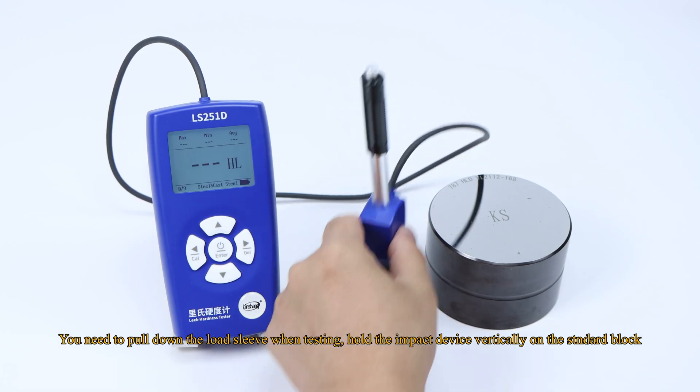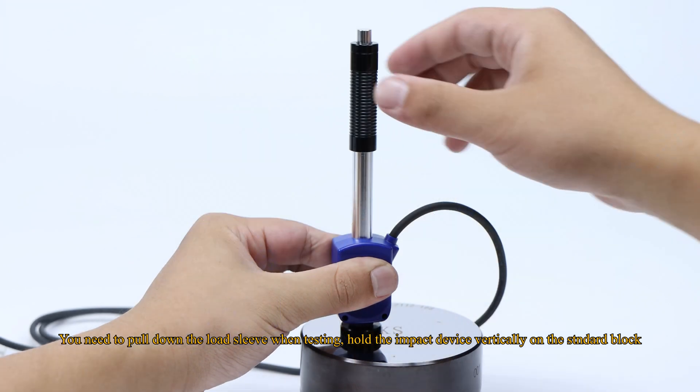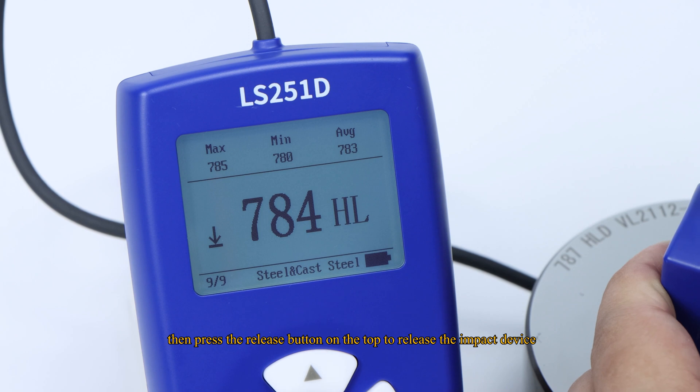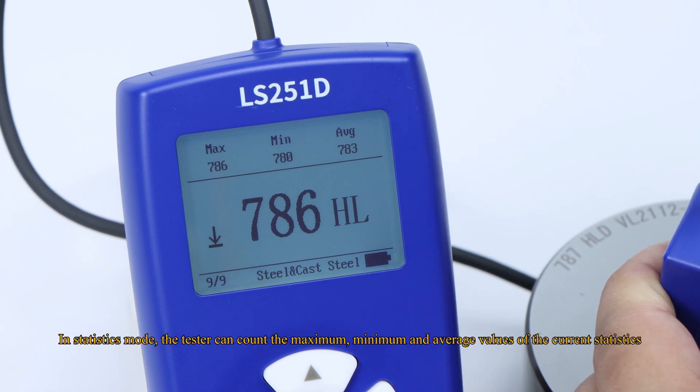You need to pull down the load sleeve when testing and hold the impact device vertically on the standard block. Then press the release button on the top to release the impact device. In statistics mode, the tester can count the maximum, minimum, and average values of the current statistics.